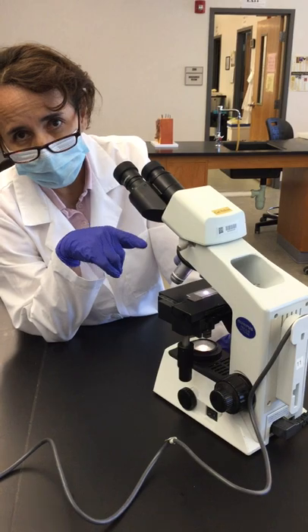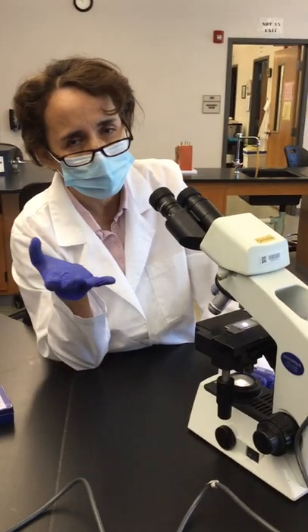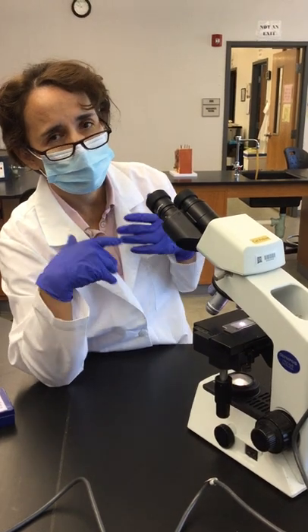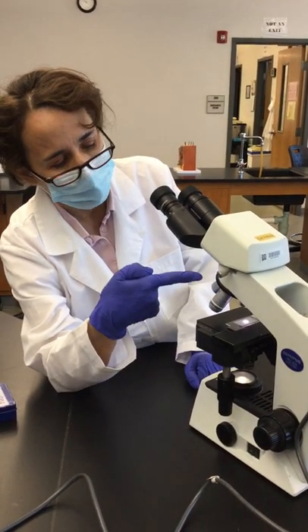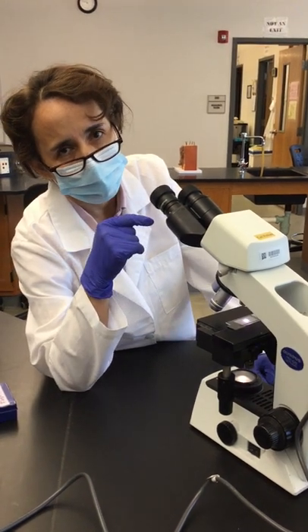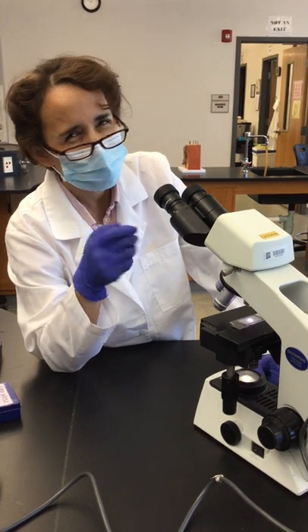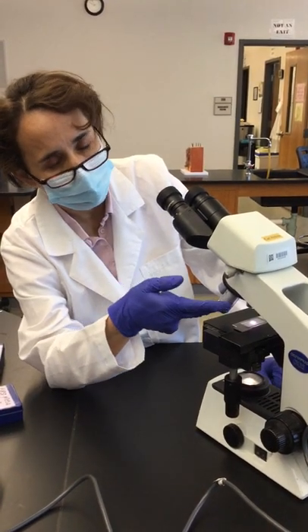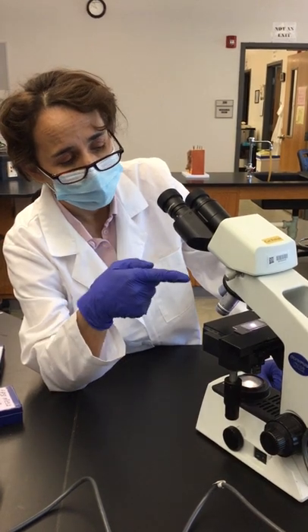Once you use the lower magnification — the one with the red ring — which magnifies the image four times, you move to the next lens. To find the total magnification, multiply the objective lens magnification times the ocular lens magnification. The ocular usually magnifies ten times, so four times ten equals forty total magnification at this setting.